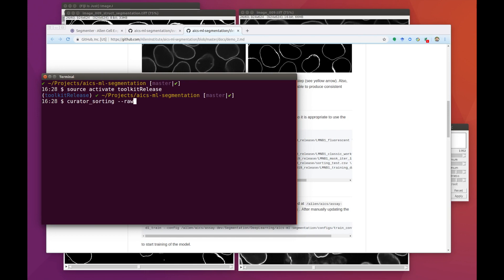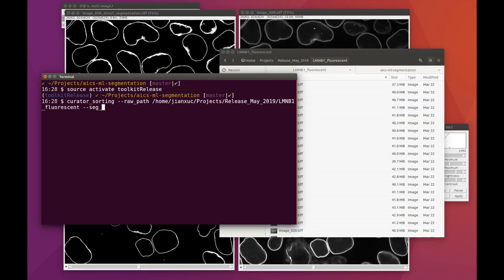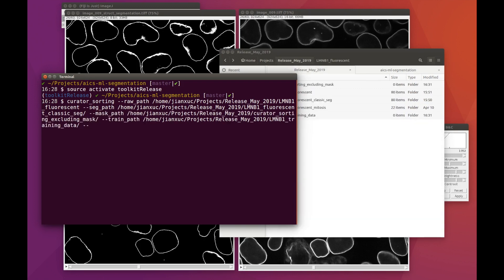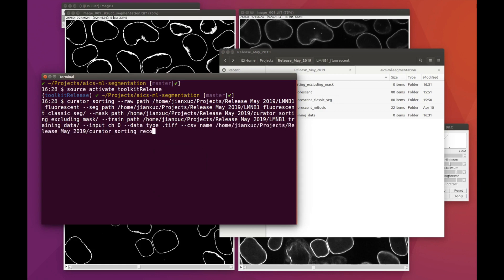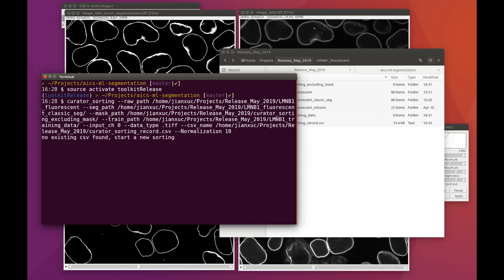We want to emphasize that the interface for doing the curation in this demo is a default version and can be easily customized. We encourage users to read through our documentation about the curator on the GitHub page. We will start the curation process by specifying the path to the raw data and the segmentations, and then the path for saving the excluding mask and the training data generated after the curation. All of the images are single channel, so we're going to set the input channel to be zero, and all of these are TIFF files. We'll use the CSV to keep track of the curating process, which would allow us to quit and resume the sorting process. Finally, we're going to set the normalization parameter — here we're just going to use the index of 10.